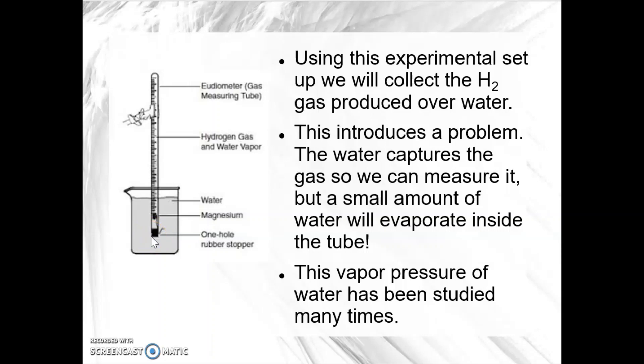And now we're going to do this reaction and collect the hydrogen gas produced. The hydrogen gas that's produced is going to bubble up to the top and push out the water, which is great because the water then is going to capture that gas so we can measure it. But it does give us a bit of a problem because no matter how much I wish it didn't, water will evaporate a little bit in that space also. So the gas that's forming at the top of the tube will not just be hydrogen gas, it will also have some water vapor.